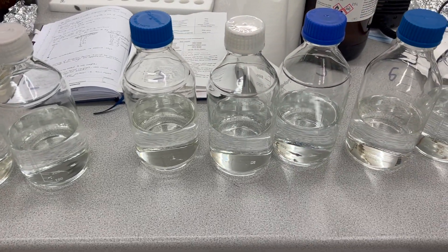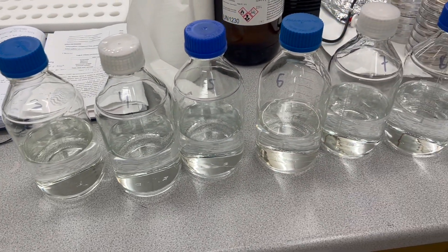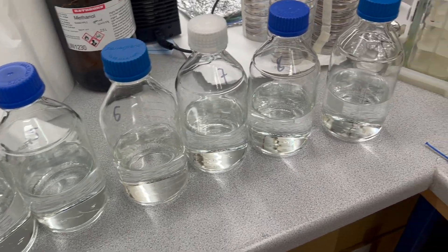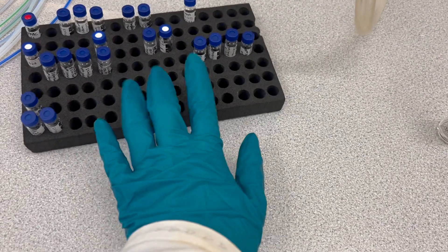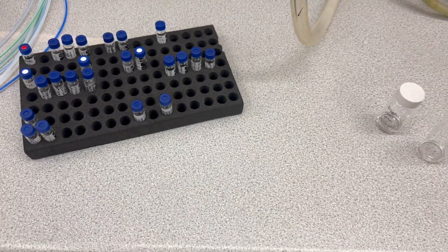Here are all of my filtered water samples — again, just Milli-Q water — and I have my spiking solutions, my internal standard and my other two spiking solutions here.